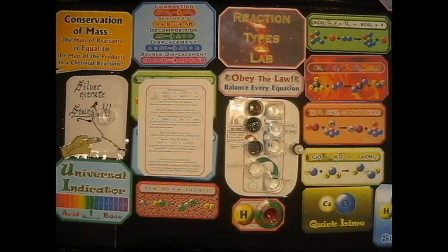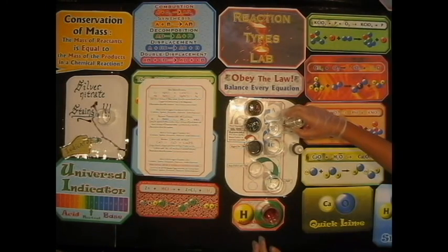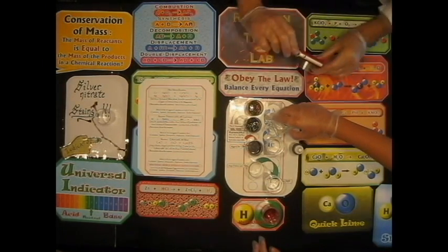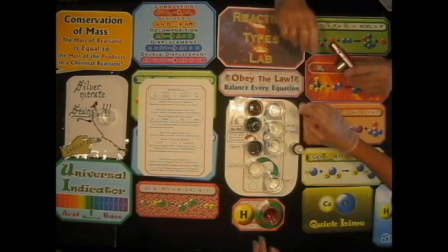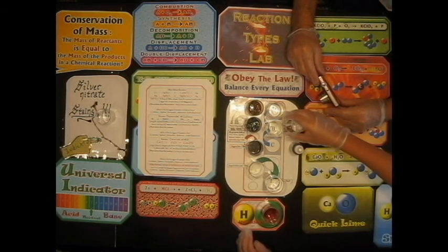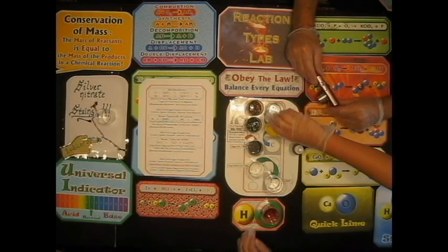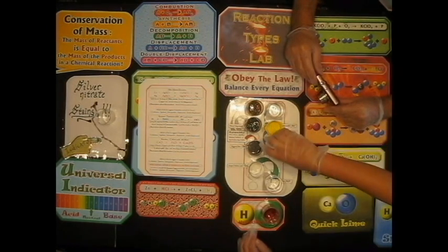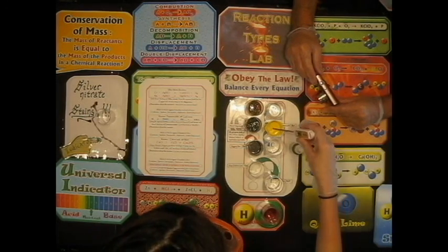So now Lucy is going to pour beaker A into B. That's an empty beaker. Just pour it in. And now she's going to add beaker C. So she put the potassium iodide in there. Notice it's clear. Now she's pouring in the lead nitrate. Do you see any signs of a chemical reaction? Yes. It happened right away.